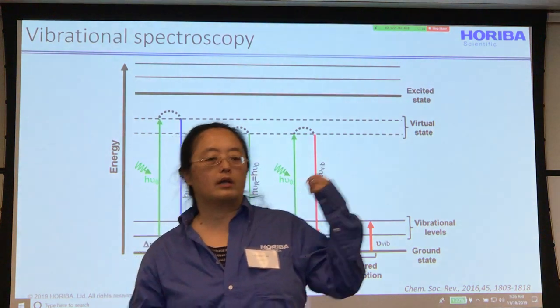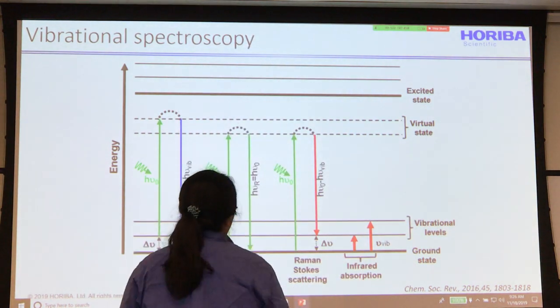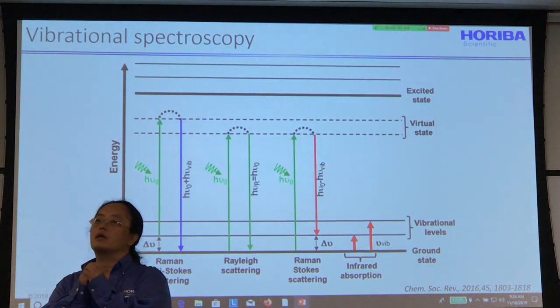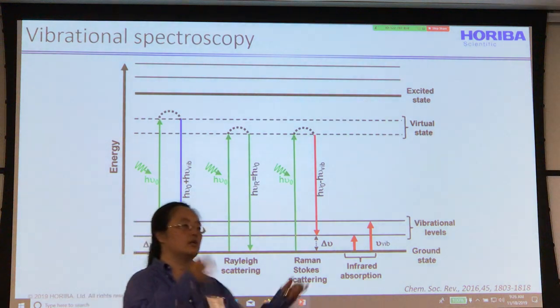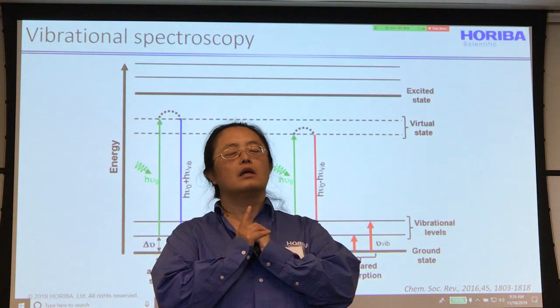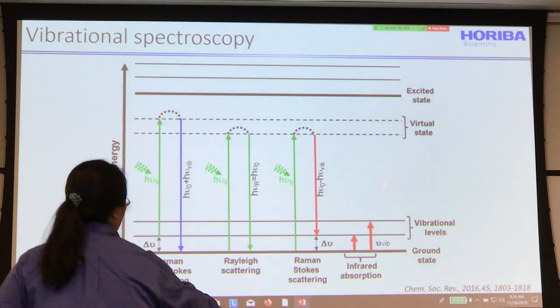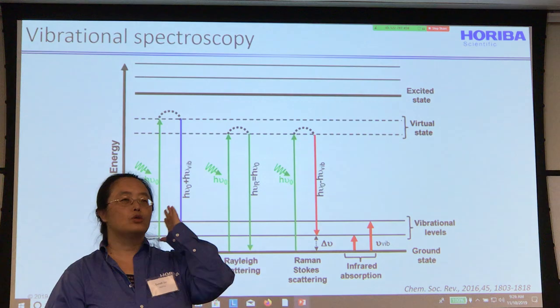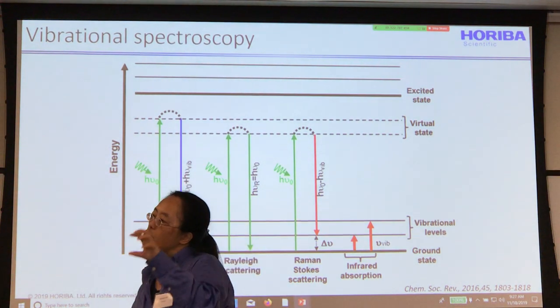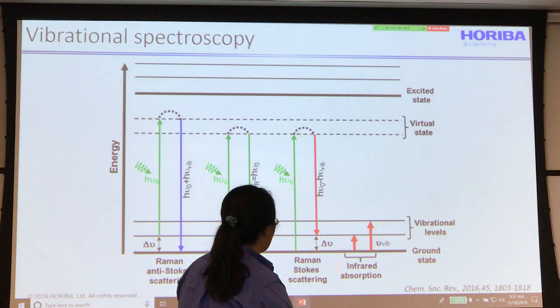And this is what we will be more focused on this week: vibrational spectroscopy. So IR absorption spectroscopy uses what is nowadays called mid-IR. There is a near-IR, there is a mid-IR, and so on and so forth. Suza will get into the details, but typically 2500 nanometers to 25,000 nanometers is where this much of the light is absorbed. So you measure the light through the sample so that you know which part and how much of the light is absorbed. That's IR spectroscopy. For Raman, you use a laser, and this is what we are going to look at.